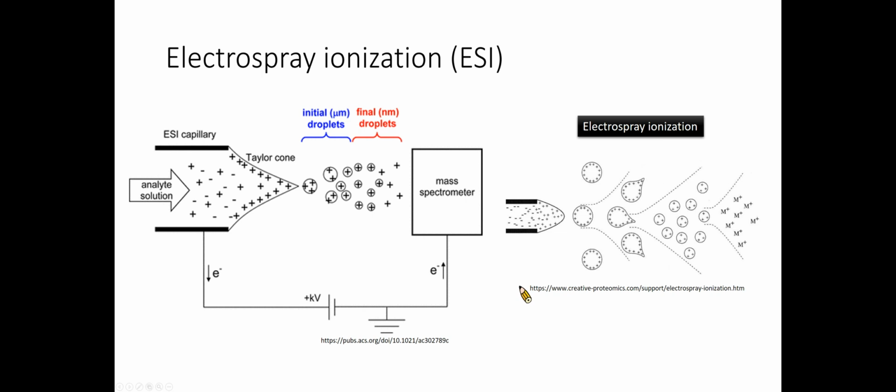Electrospray ionization (ESI) is the most prominent technique among the group of atmospheric pressure ionization methods. Electrospray ionization is a soft ionization technique that is typically used to determine the molecular weights of proteins, peptides, and other biological macromolecules. ESI is extremely useful for the analysis of large, non-volatile, chargeable molecules because this process does not fragment the macromolecules into smaller charged particles.